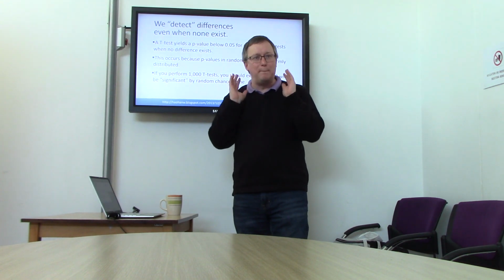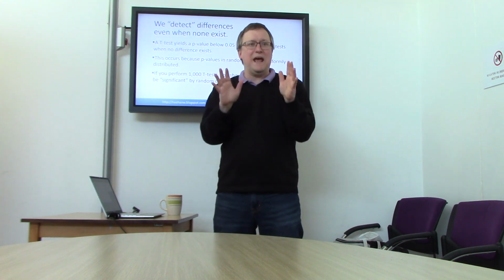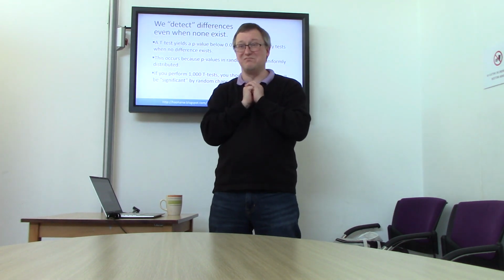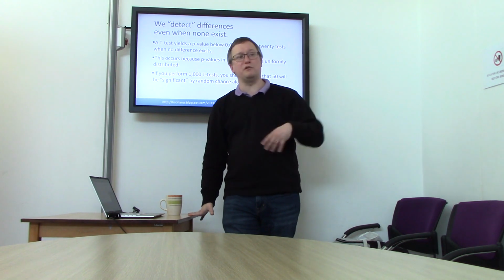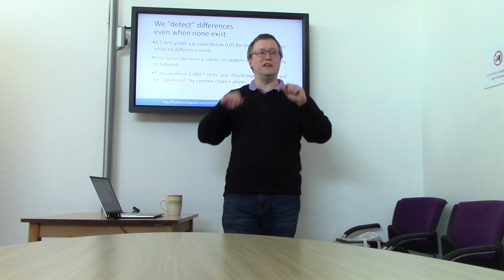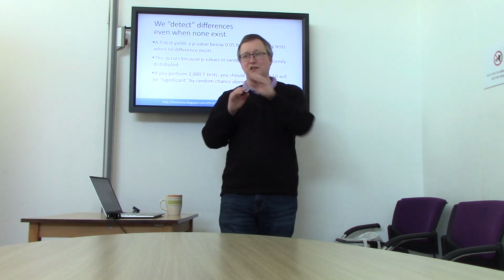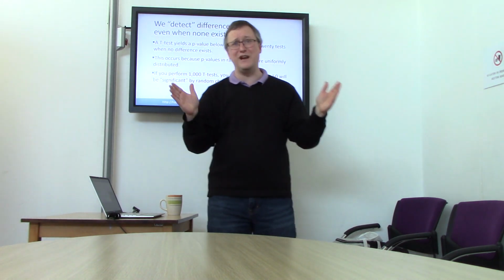Because if you do a bunch of T-tests or a bunch of linear model tests, however you're doing it, we expect that 1 in 20 of these tests will give us a significant p-value even when no difference exists between the cohorts. That may not seem sensible, but it's true. If you simply work through a big table of random numbers that are generated from exactly the same distributions, you will find that you detect differences by random chance 1 in 20 times if you're using a p-value of 0.05 as your threshold. That's because the p-values are distributed uniformly across the 0 to 1 range.